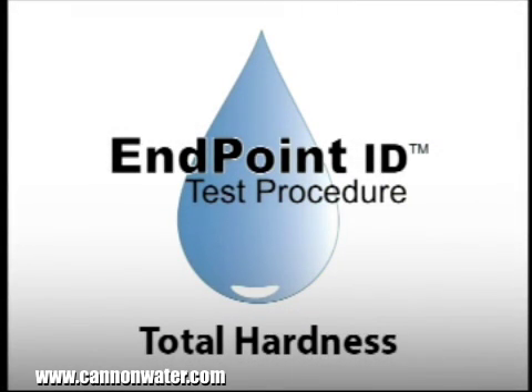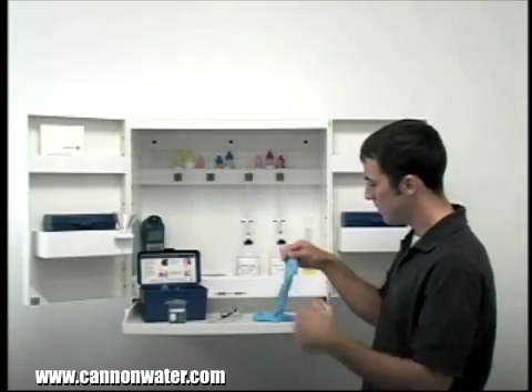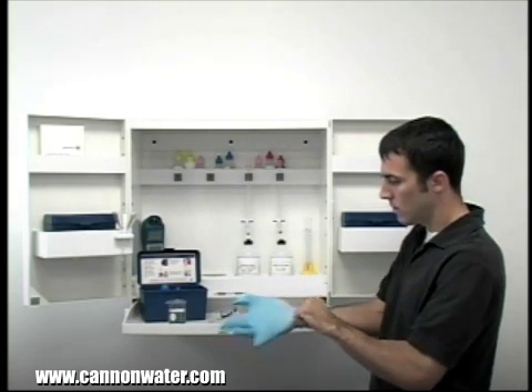This is a demonstration of a total hardness drop count test kit using endpoint ID procedures. Anytime you're about to handle chemicals, you need to wear the proper safety equipment. In order to perform a drop count test, gloves and safety glasses are required.